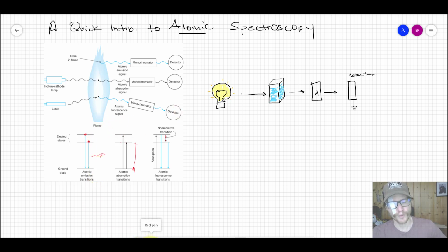For the absorption, or really in any of these scenarios, we're talking about absorption of light by a metal, and in that case we need to get that metal by itself. So typically these samples are aqueous samples where we want to measure, or they don't have to be aqueous, but when we talk about a metal, we're not talking about like a slab of lead.